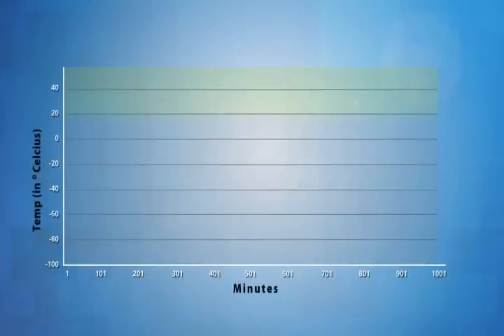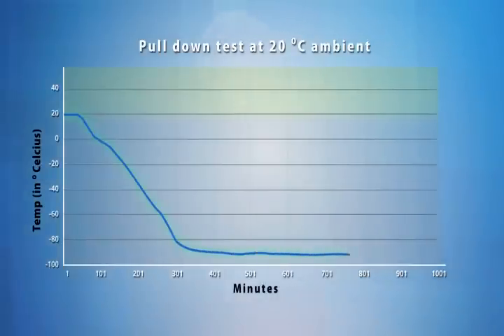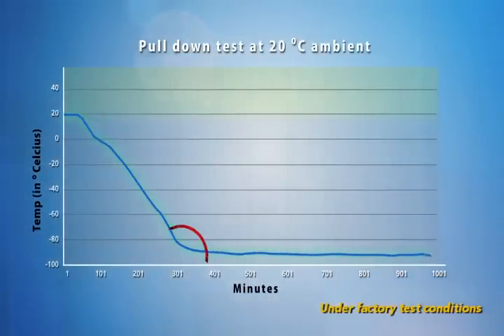Cooldown time is the time required to lower the temperature of the ULT Freezer from ambient to the set temperature. The ESCO ULT Freezer can achieve a cooldown time of 306 minutes from 20 degrees Celsius to minus 80 degrees Celsius under factory test conditions.